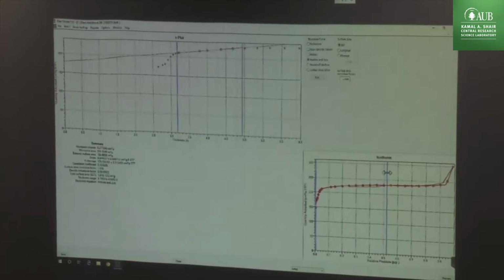Okay, you see how I can expand it there? See, but in any case, it should be a straight line. Okay, so the monolayer, multi-layer, and then condensation. Okay, so any point in the straight line is your t-plot analysis. Okay, so we have a good relationship.